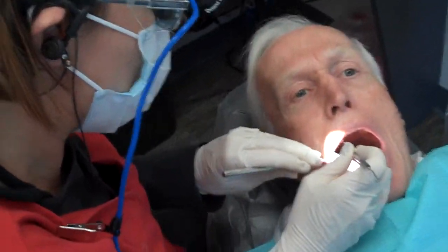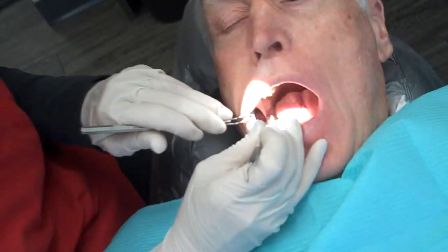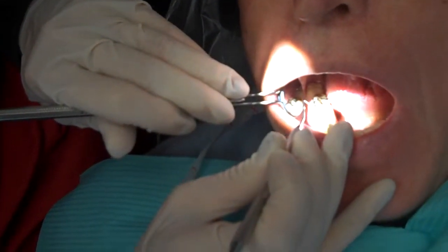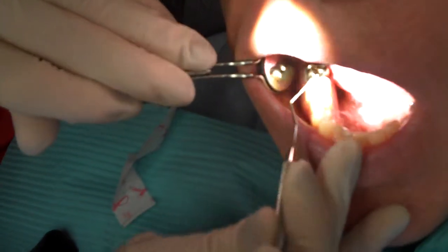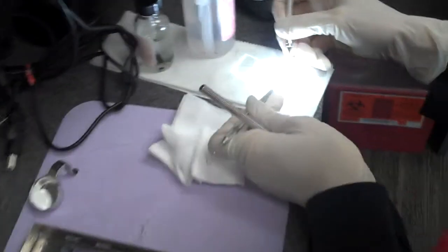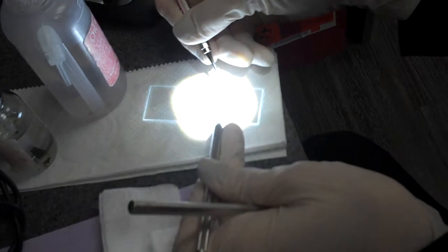Then I just take a periodontal probe and gently tease that plaque out from under the gum line in a deeper area. You don't need much — just a little tiny bit will do. I usually sample a few different areas to make sure that we're getting the worst of the worst.